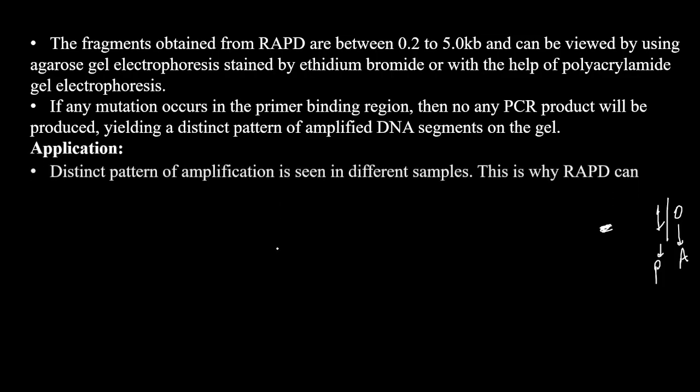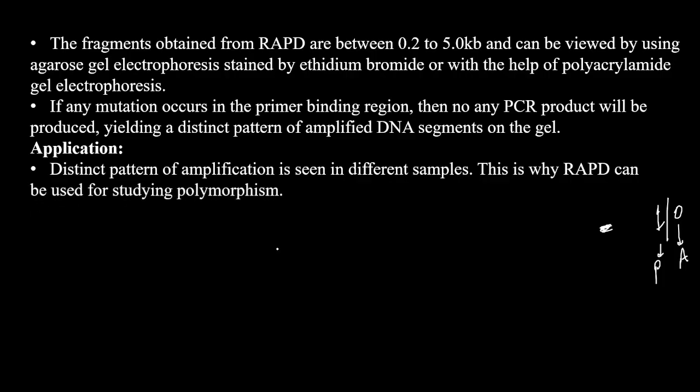So what are the applications? You can see a distinct pattern of amplification in different samples, because in some individuals the amplified region is going to be, let's say, 0.2 kb, but in some other individuals it could be 0.5 kb or something like that. So you can differentiate them.